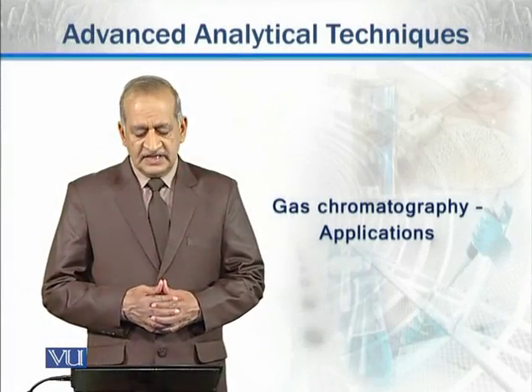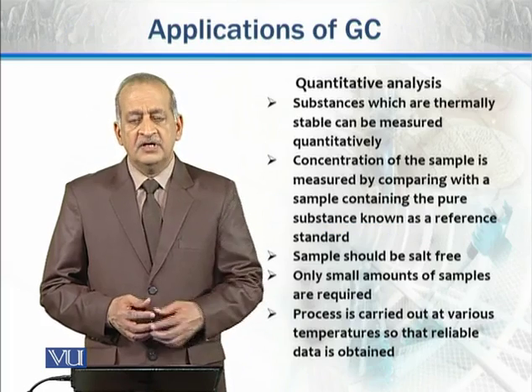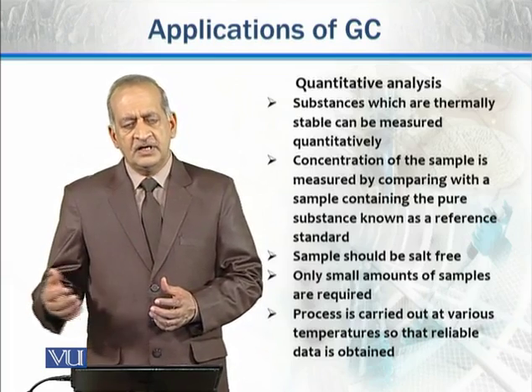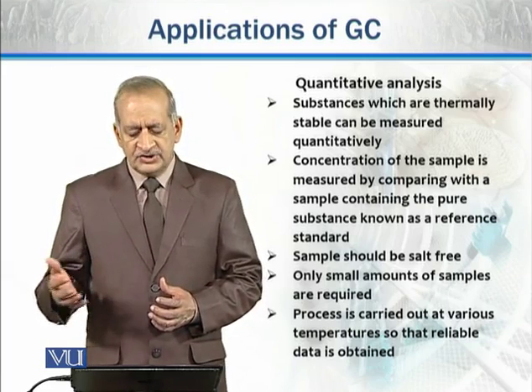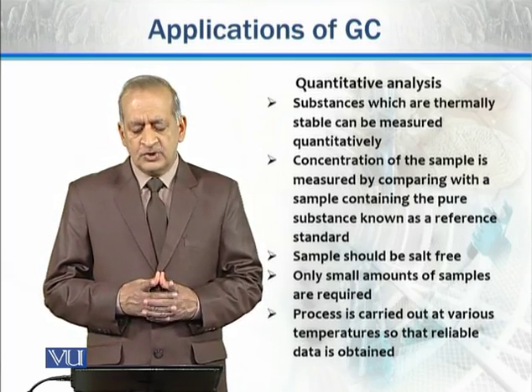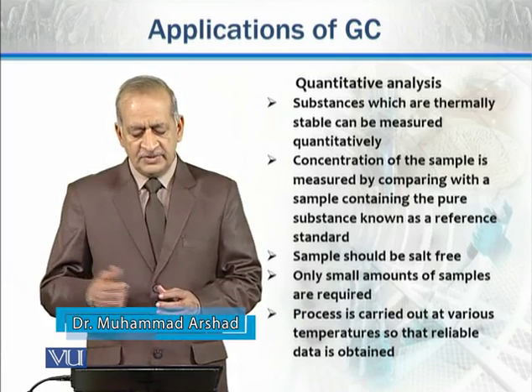Now we will discuss applications of gas chromatography. This technique is very beneficial. It's used in almost all scientific fields. It has application in forensics, in biological fields, in industrial fields, and so on. It is quite commonly used in various fields of the modern biological, industrial, and chemical fields.